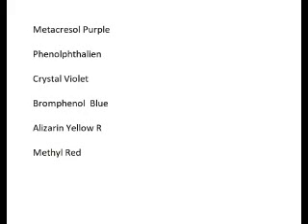The 6 indicators we're going to be testing today are metacresol purple, phenolphthalein, crystal violet, bromophenol blue, alizarin yellow R, and methyl red.